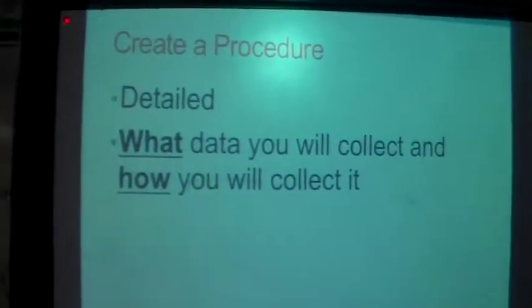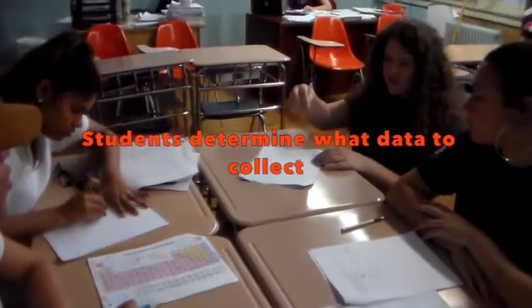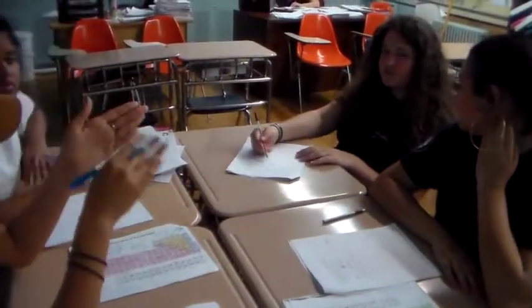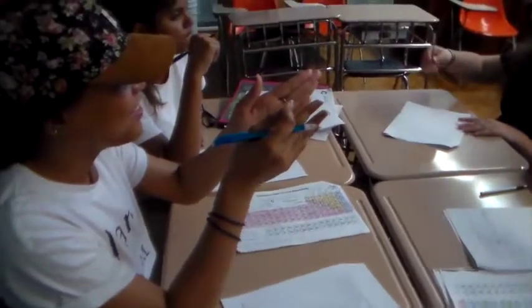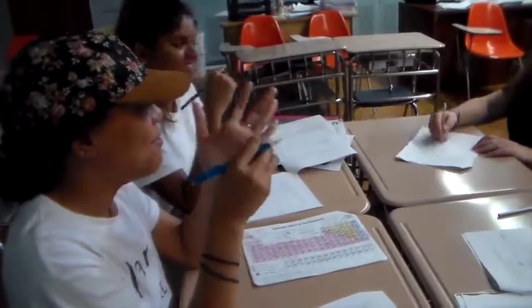What data will you collect and how will you collect it? Oh, we have to collect how many drops. We have to keep track of the drops we pour until it turns pink.